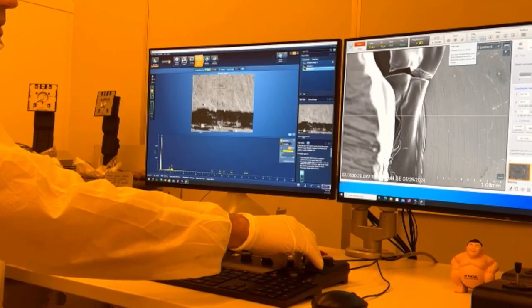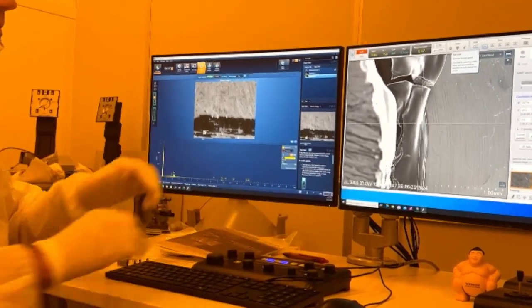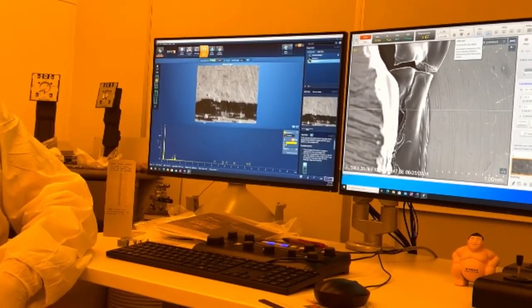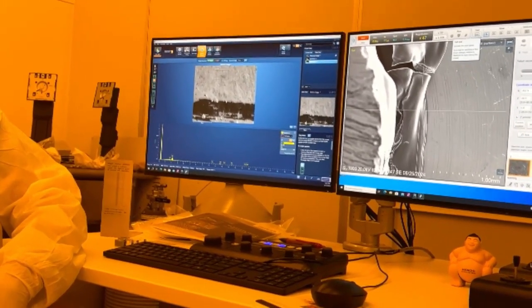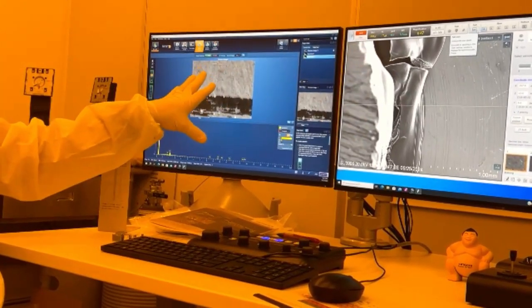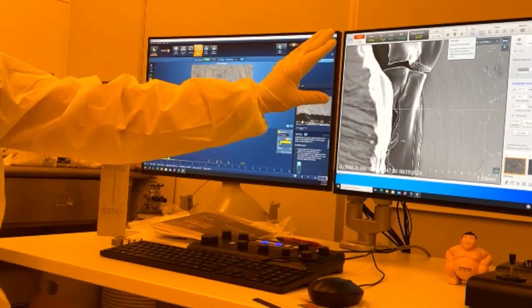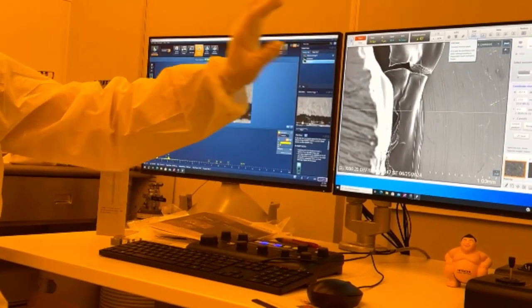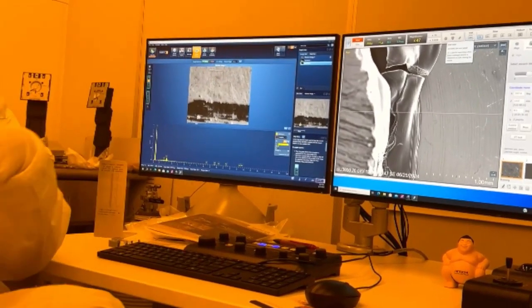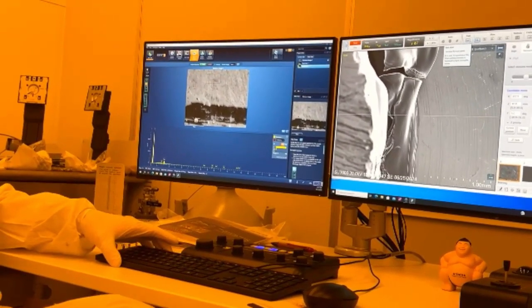So in terms of resolution, whatever we could get over there is what we will get for the X-rays as well. So whatever we get here for imaging is going to be the image here, but like I said, X-rays don't care about a pretty image.